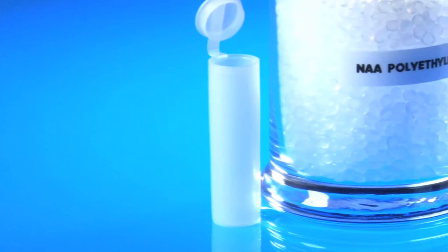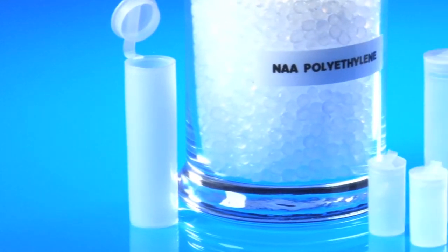In many instances, only one-twentieth of a gram is sufficient to gather an accurate material sample. Materials from many industries can be analyzed. This includes testing semiconductors for purity, determining the elements in archaeology artifacts and geology, to assist the understanding of the various processes by which rocks are formed.